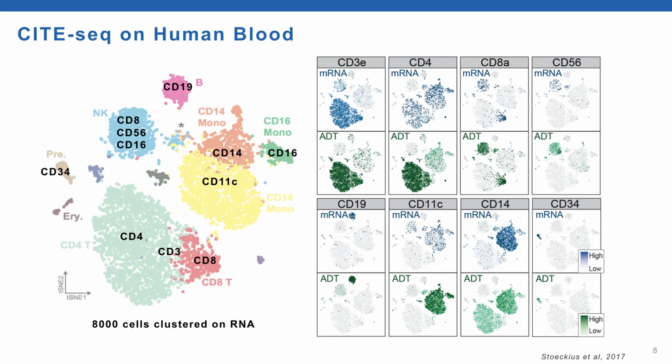So the other thing is that you can see signatures of potentially post-transcriptional regulation here. If you look at the CD4 example, in both monocytes and T cells, it seems to be detected at relatively similar levels in terms of the number of cells that the transcript is detected in. But the protein levels seem to differ quite markedly between these two cell types.